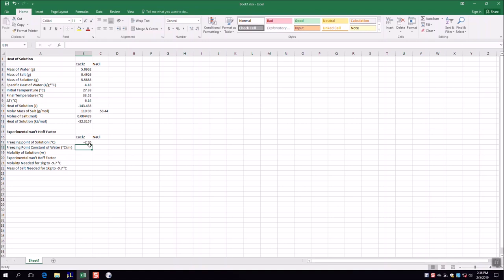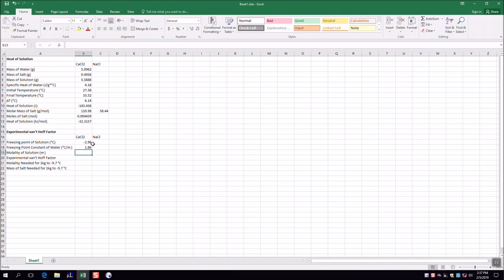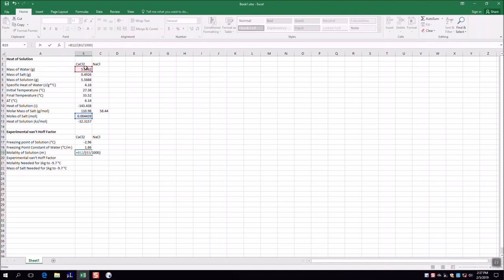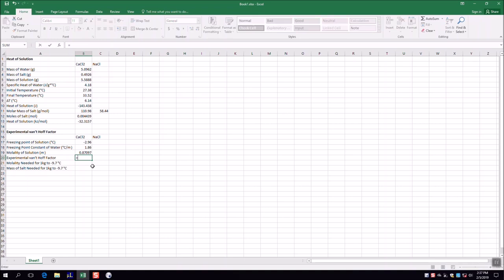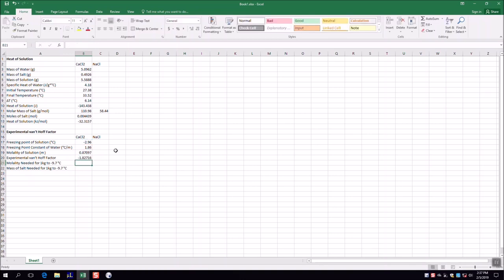Now in Excel, to calculate the experimental van't Hoff factor, we need: the freezing point of the solution (−2.96°C), Kf (1.86°C per molal), and the molality. Molality = moles of solute (already calculated) divided by kilograms of solvent. Take the mass of water in grams and divide by 1000 to convert to kilograms. This gives us a molality of approximately 0.87097. Then i = ΔTf / (Kf × m). The result appears as negative 1.8 because the freezing point decreased — change the sign of the freezing point to 2.96 to get a positive van't Hoff factor of approximately 1.827.